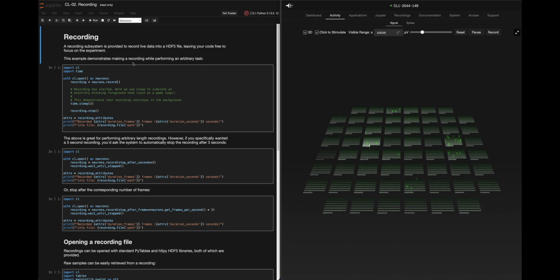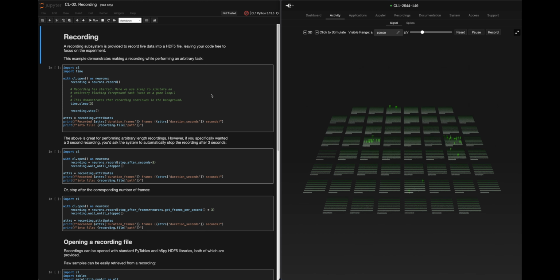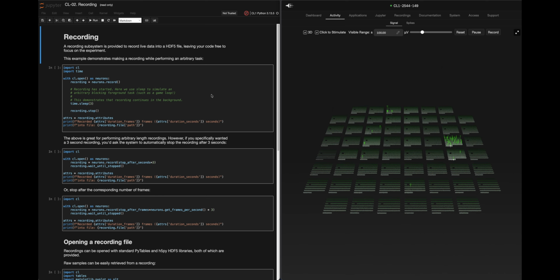So we're not working with JSON, we're not working with CSV, we're working with HDF5, which is the data format. To give you some context, this data format is often used in financial settings, medical settings, and probably some forms of hardware engineering where you need very, very granular data that can be reformatted to suit the needs of the project. And in this case, we're dealing with biological data. So let's jump right in.